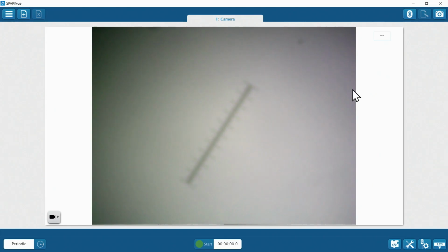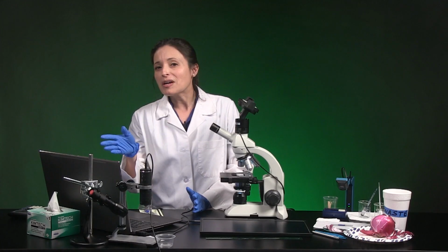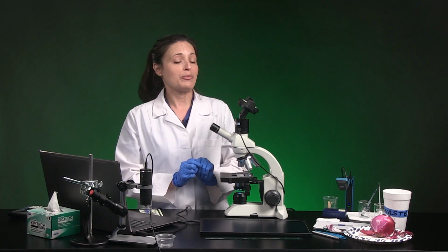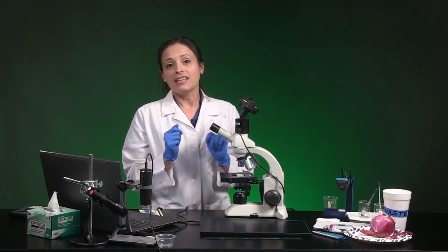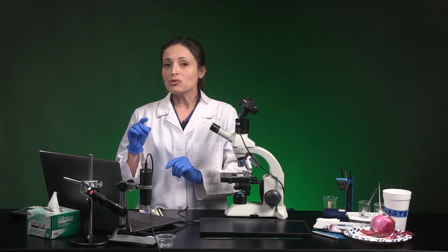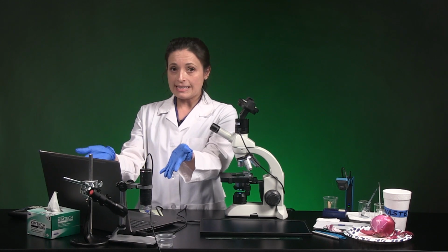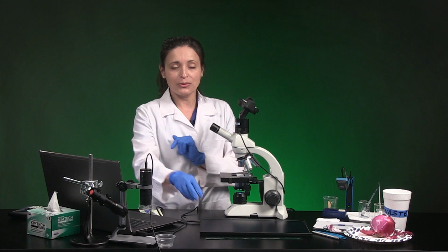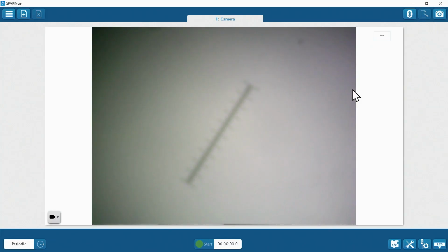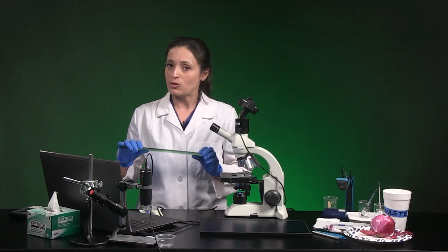Then there's the digital image to consider. You have to figure out the digital magnification on the screen for each microscope objective size. You need to calculate digital screen magnification by taking the actual millimeters across the screen as measured by a ruler and dividing by the millimeters as measured through the microscope. I'll use a micrometer calibration slide to get the microscope distances.